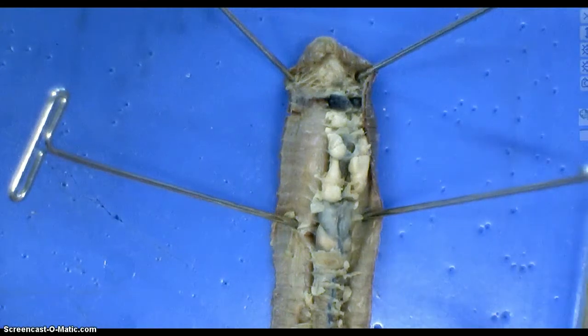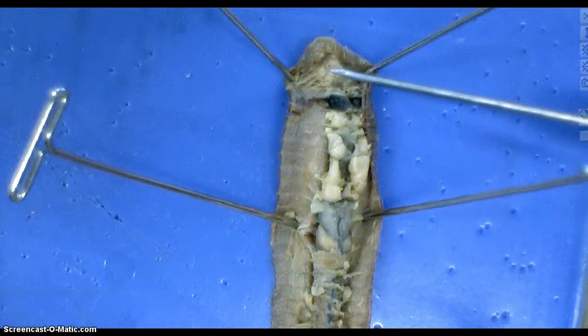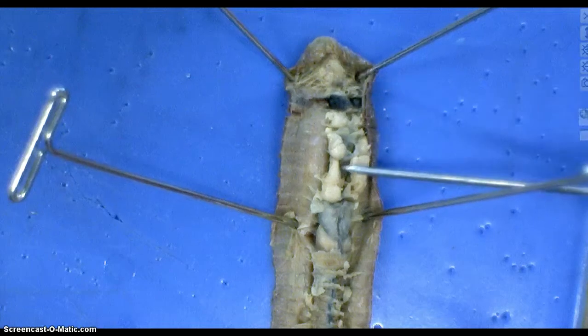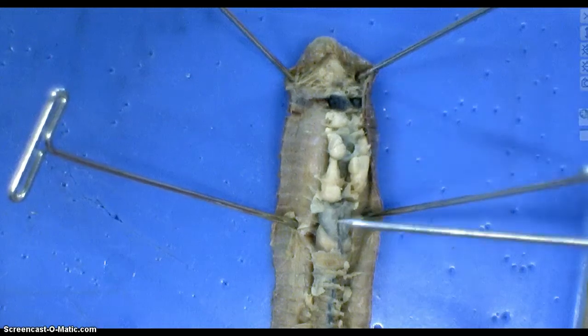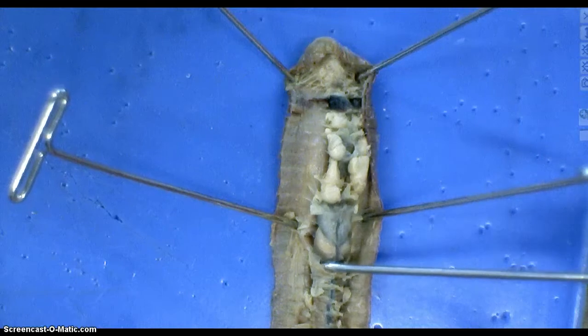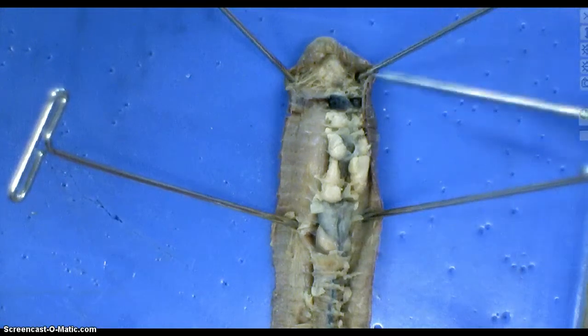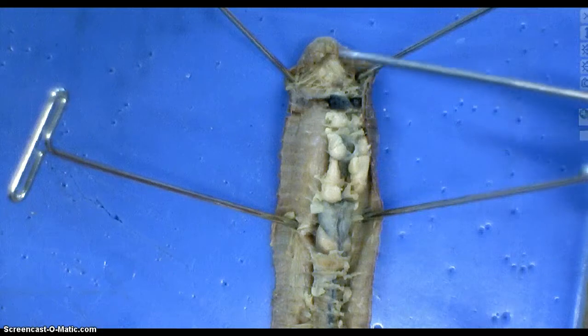You will need to actually gently touch the different parts of the worm so you can tell which is which. Because believe it or not, they do feel differently based on what they do, because structure is related to function.